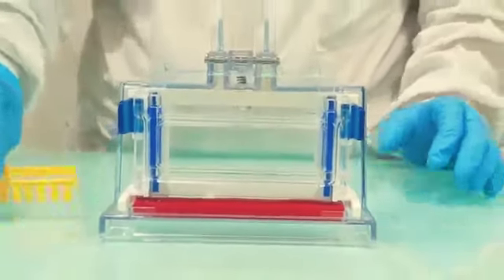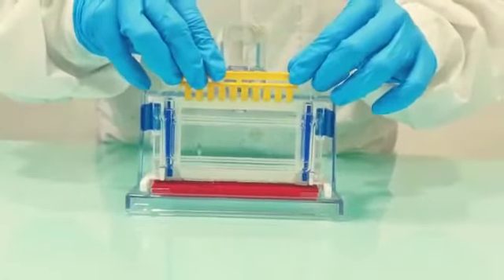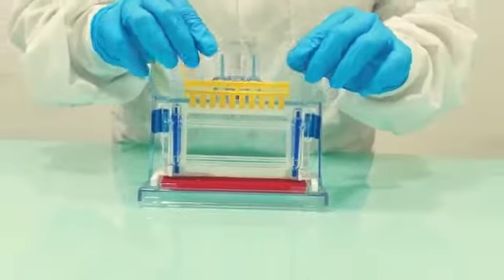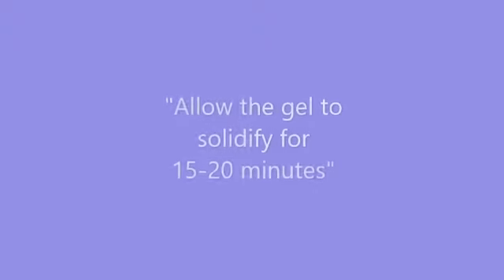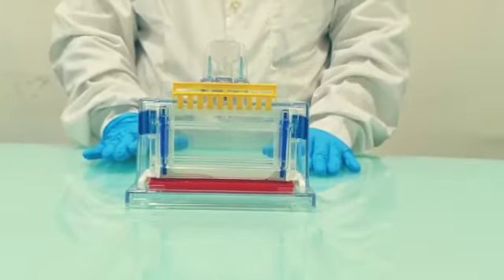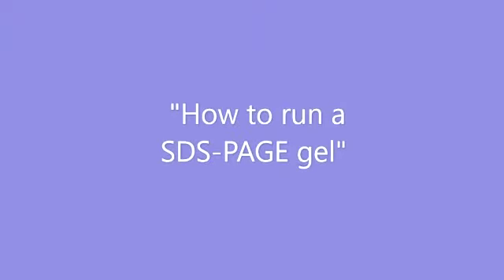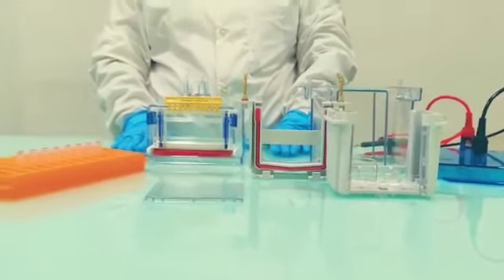Now insert the comb gently. Allow the gel to solidify for 15 to 20 minutes. Now, we will proceed with the running of the gel.